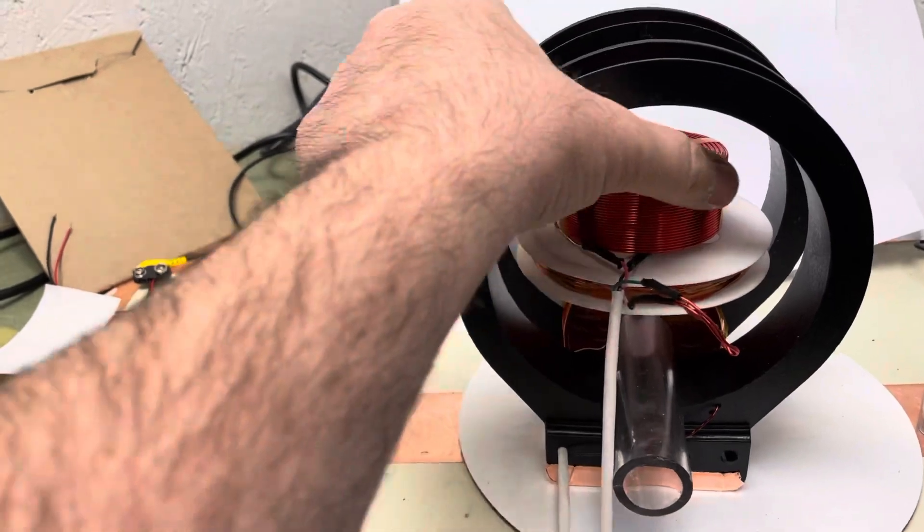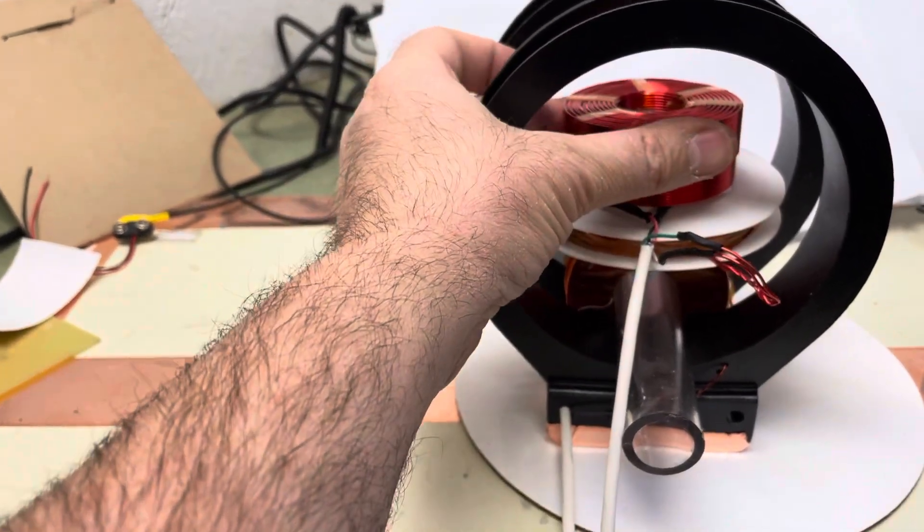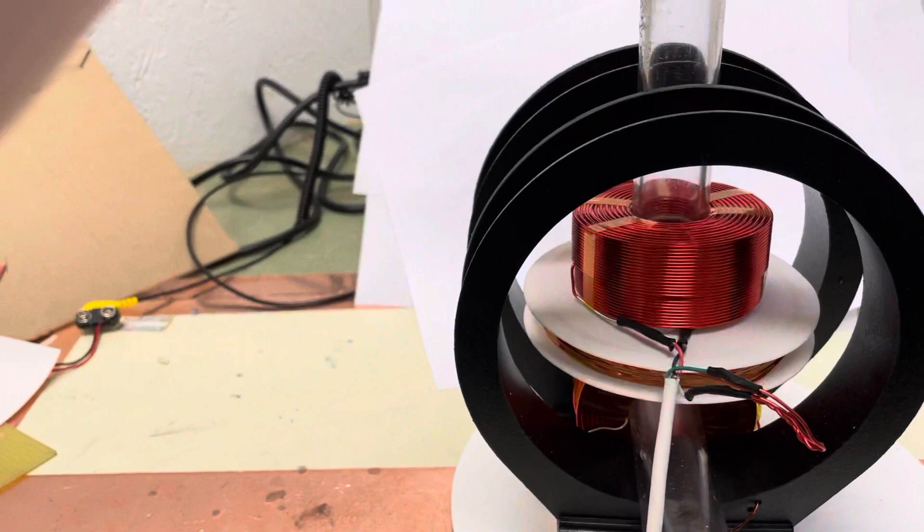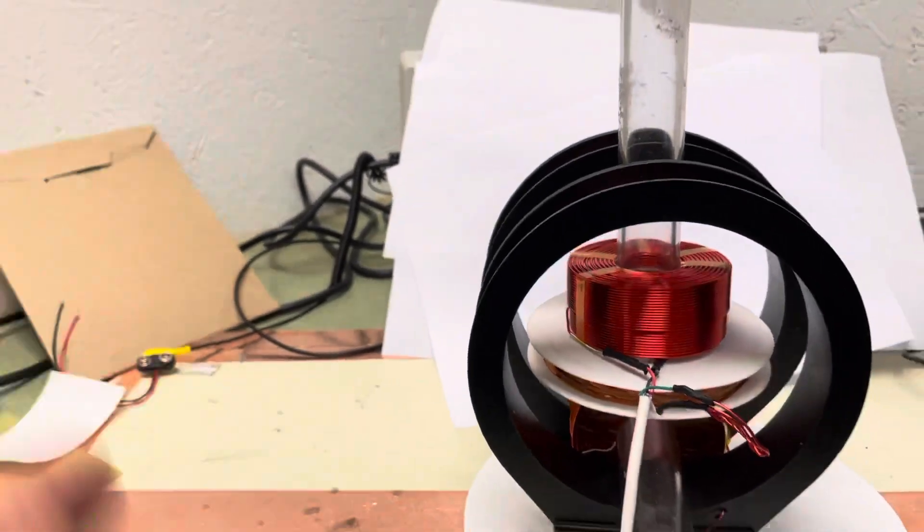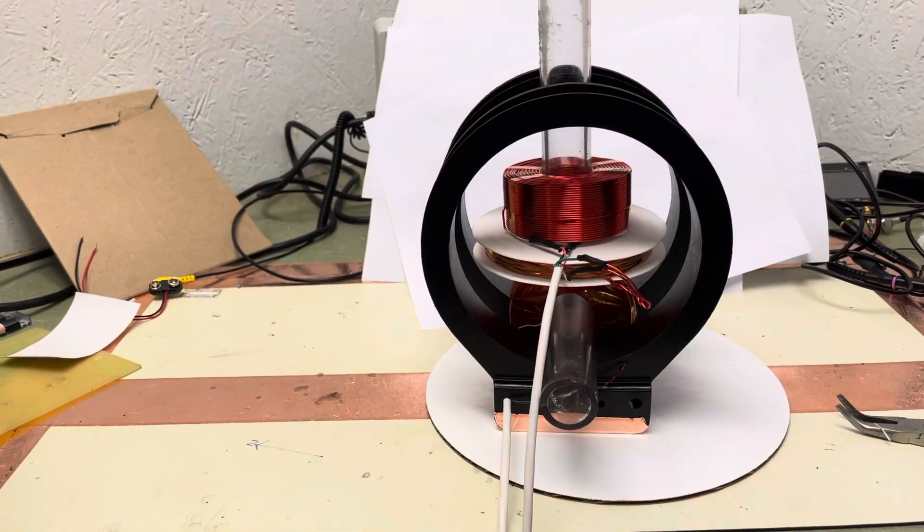And then this is my pre-polarizing coil, and then I have a tube that can fit in the top of that that can go up to the top of the chamber.